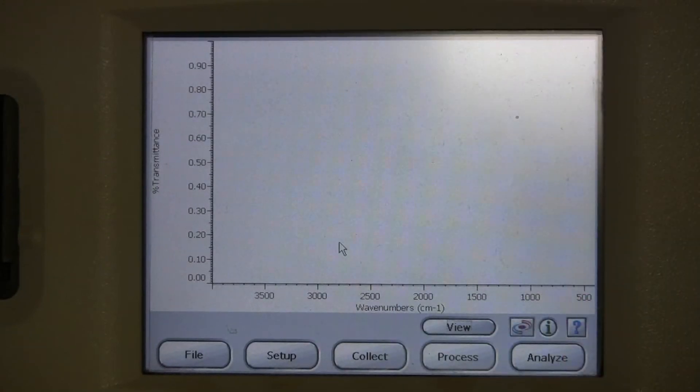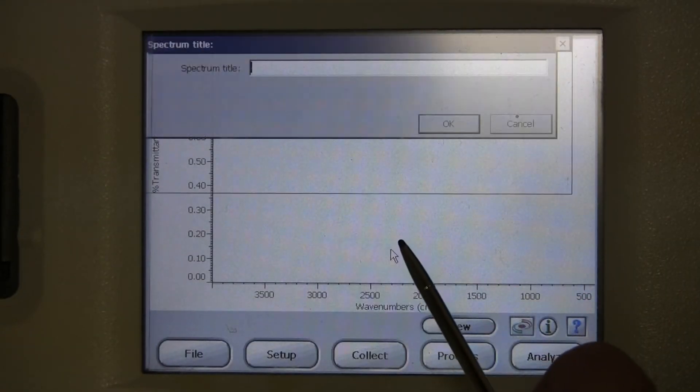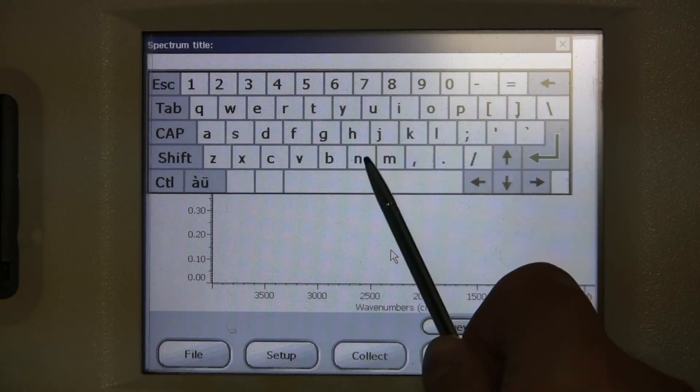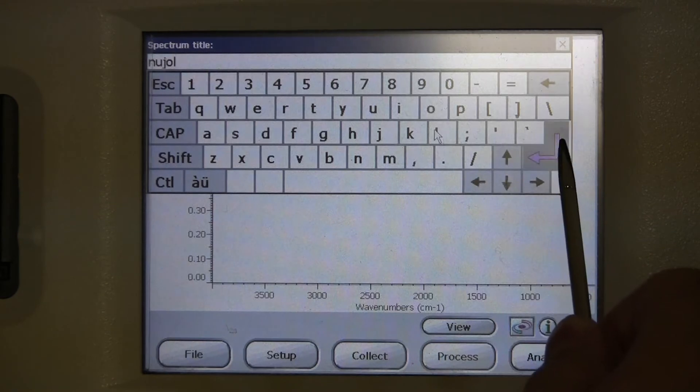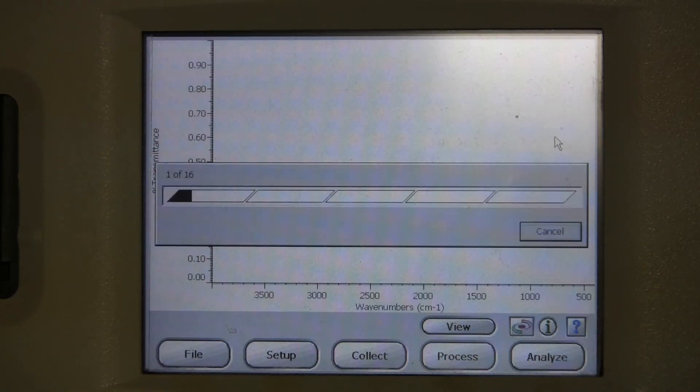Once again, start off by going to Collect, and then Sample. Type in anything, usually something descriptive. Wait for the scans to finish.